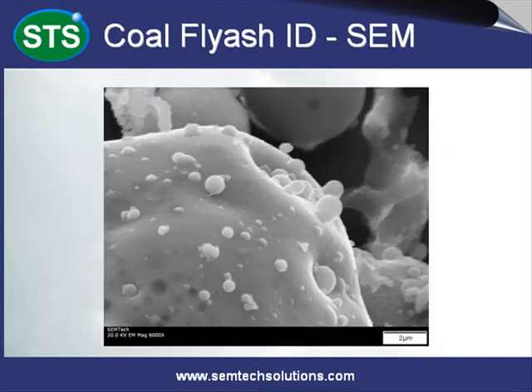SEM imaging of coal fly ash exhibits symmetrical smooth round spheres, sometimes with spindle or dendritic features. Oftentimes, large fragmented spheres consist of numerous smaller spheres, as shown here.